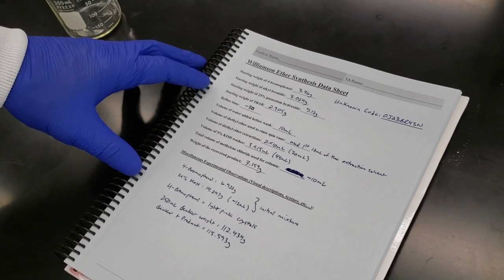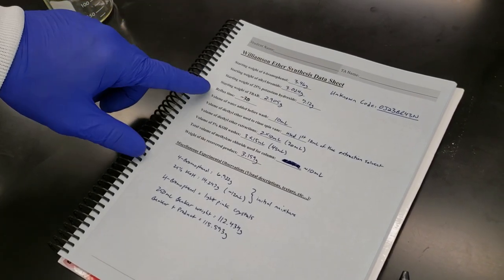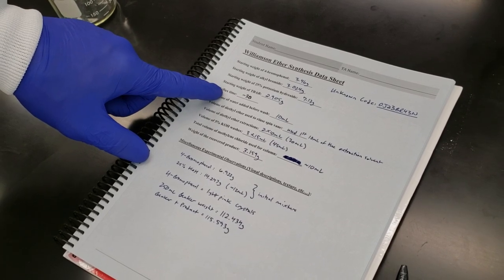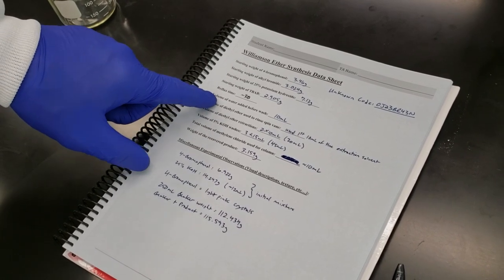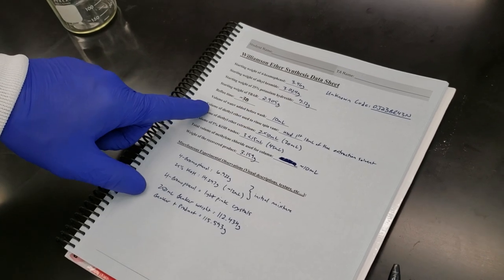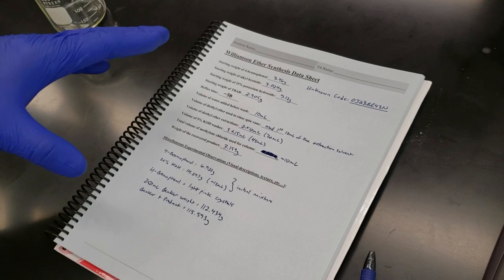Let's do a quick recap of our data sheet here. Since we last looked at it, we've added quite a bit of data. We've got a reflux time of approximately 30 minutes. The volume of water that we added before our wash was 10 milliliters. The volume of our diethyl ether used to rinse our spin vane: we didn't use a separate portion.